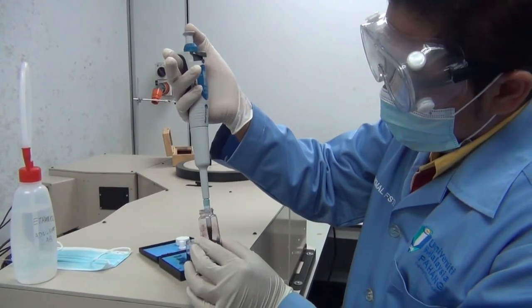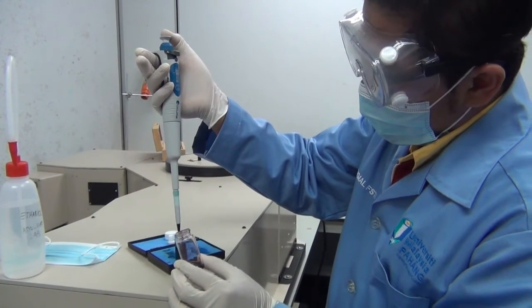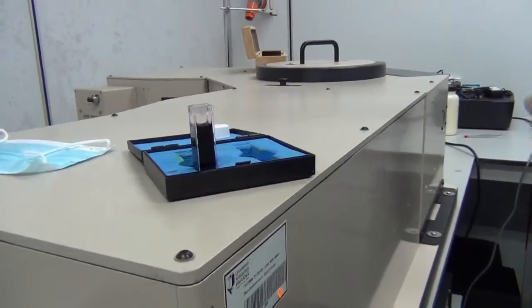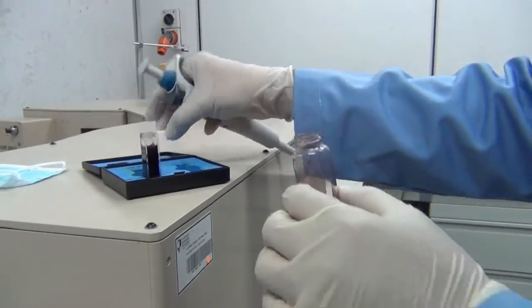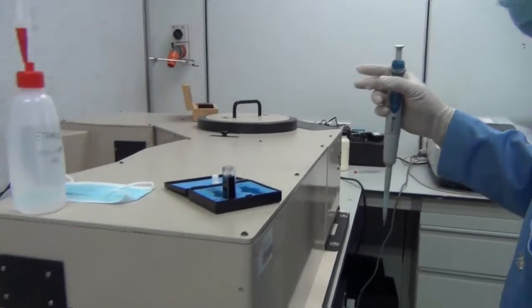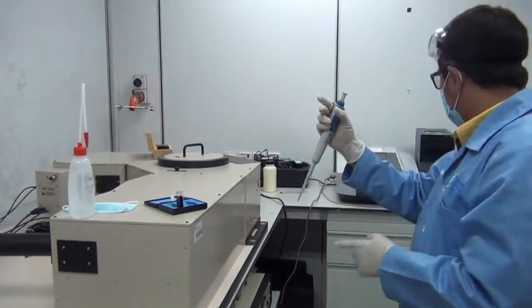One more. And that will be fine. Now, how about the waste? Okay, make sure you always put the cap on back again, and this tip needs to be thrown away.